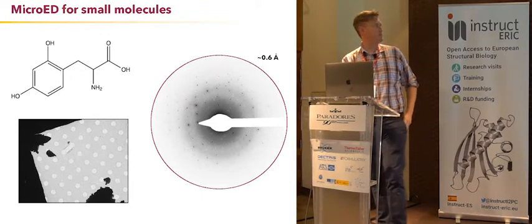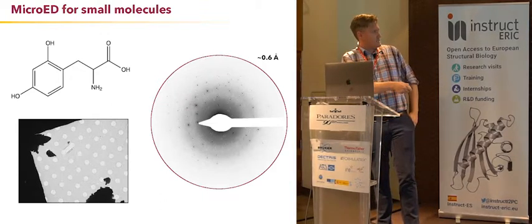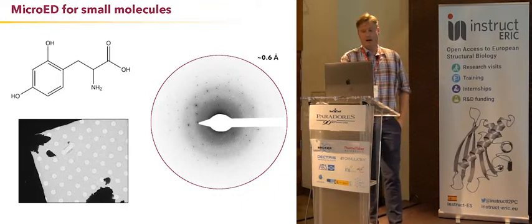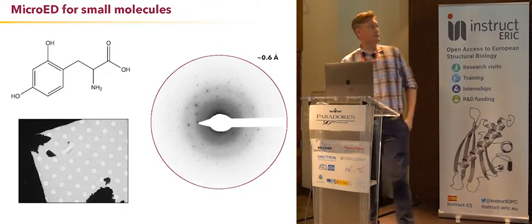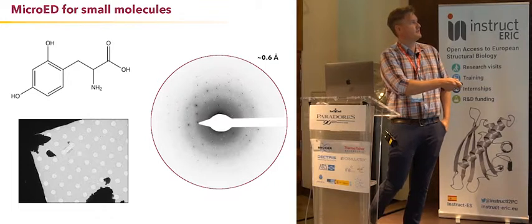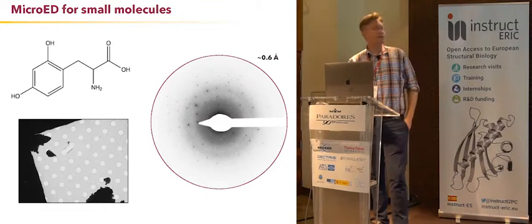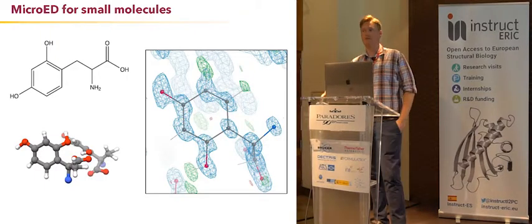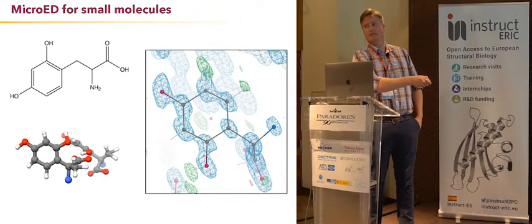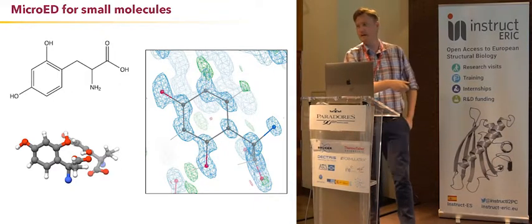So we took the sample, again, made a little grid of it. We're shooting this little thing right here. It's like 0.5 micron by 1 micron by a couple hundred nanometers thick. Diffracted really, really well. This is sort of the output of XDS. You can see all the predictions or the circles and all the reflections or the dark circles here. Took this data, ran it through ShelXT, just searching for all carbons, and this is what we get. And we see, sure enough, yep, we're missing the beta carbon, and it's been moved back here.